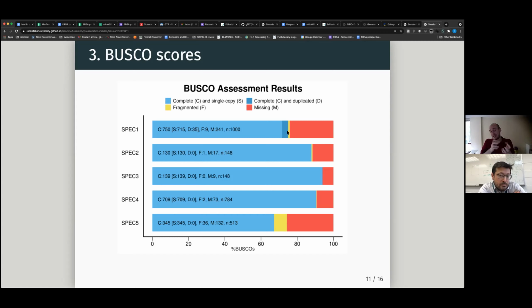The assembler says, they're not similar enough to contribute to the same thing, so I'm going to generate a new contig that corresponds to these reads that are different enough.